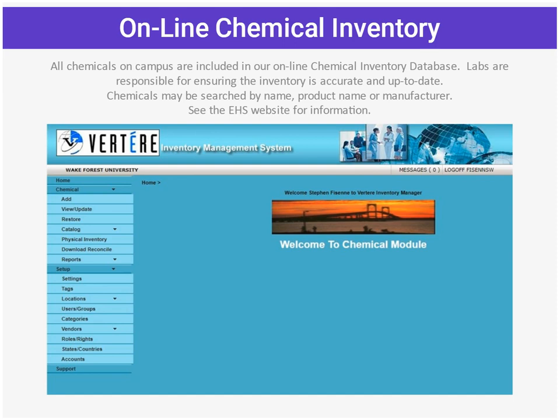All chemicals on campus are included in the online chemical inventory database. Labs are responsible for ensuring the inventory is accurate and up to date. Chemicals may be searched by name, product name, or manufacturer. See the EHS website for information.